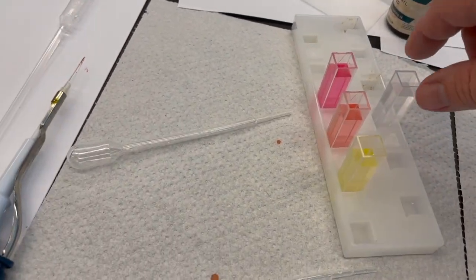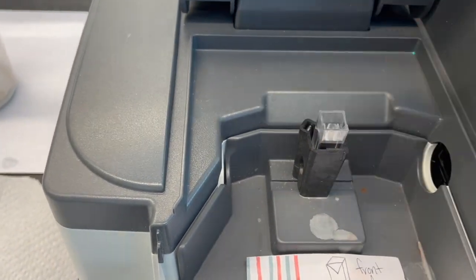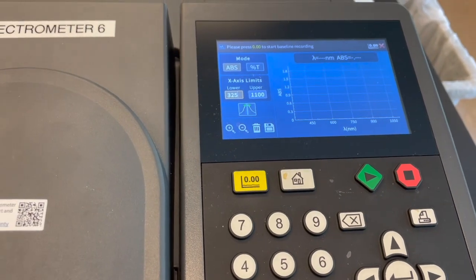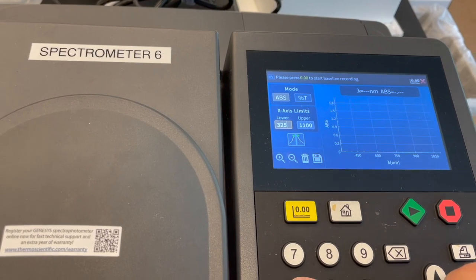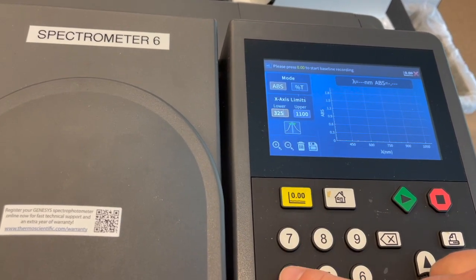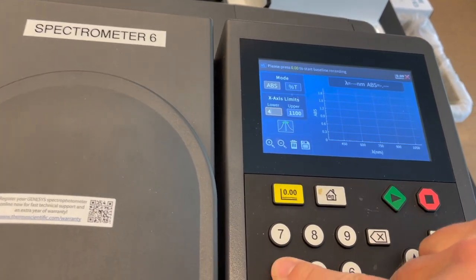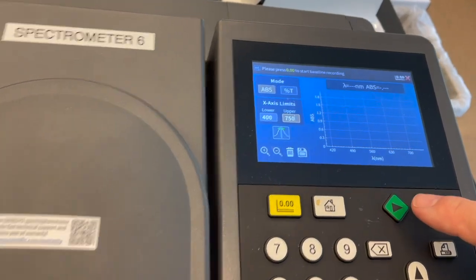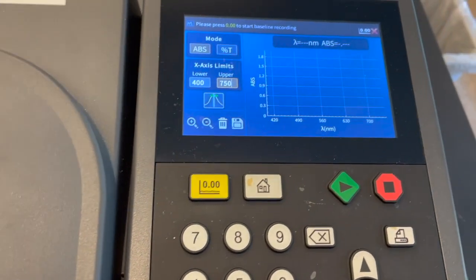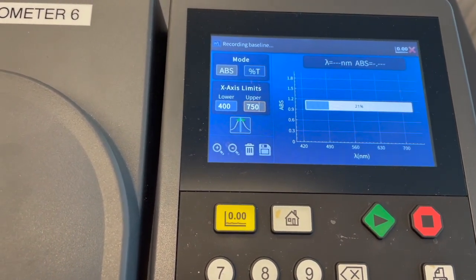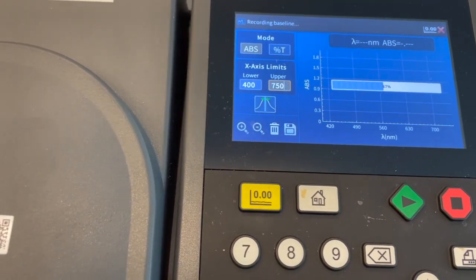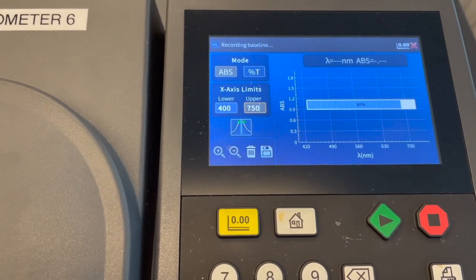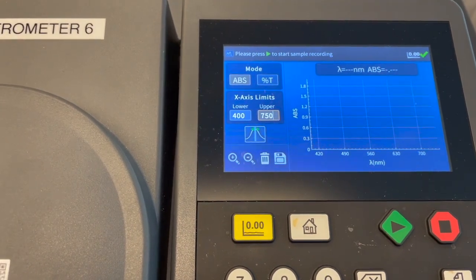Before I can run a spectrum of any of these things, I have to zero the instrument. So I have a cuvette with buffer. I close the lid because I want to get a spectrum of the buffer, not of the room light. I want just the visible region — this instrument will go into the ultraviolet and into the infrared a little bit. So I'm going to change the lower limit to 400 and the upper limit to 750, which is the visible region. Then, as the instructions say, press 00. It will scan through the spectrum of water and then subtract that away from the other spectra you take. It holds this spectrum in memory, and one background like this can be good for many spectra.